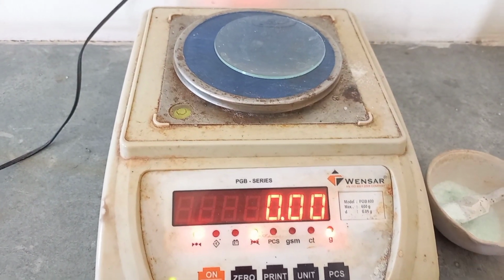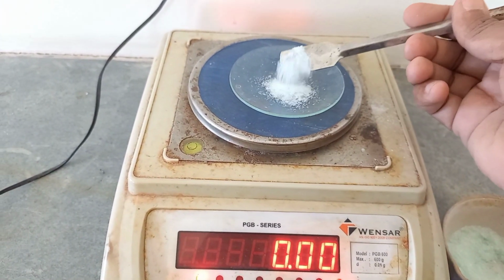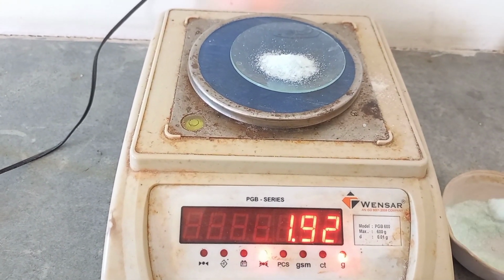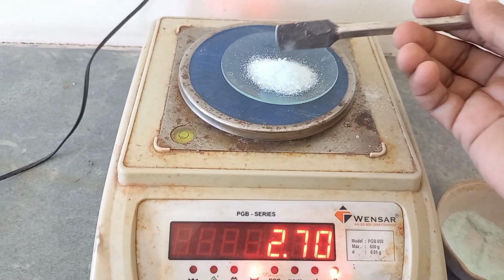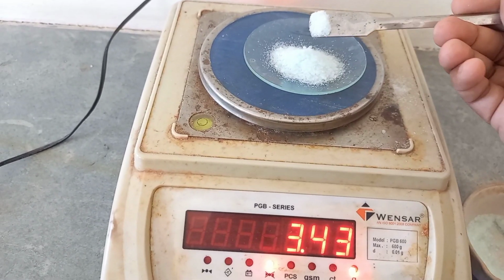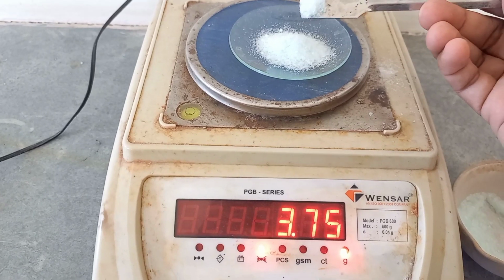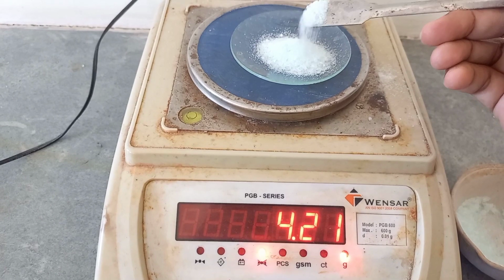Just press the button to zero, and as we have calculated the amount 4.9, let's start pouring the salt on it, and we will get 4.9 gram of the salt. In this manner you can measure the salt required for preparation of the standard solution. Students, in your laboratory there can be a different electronic balance, so you can discuss with your lab attendant how to operate that.